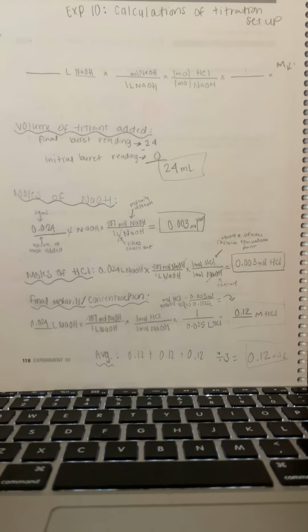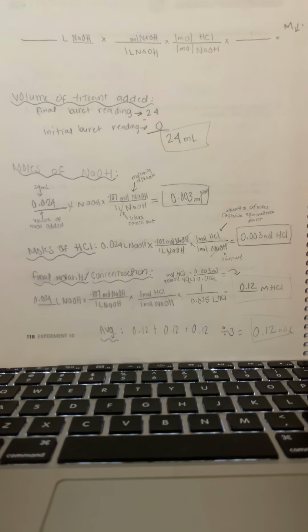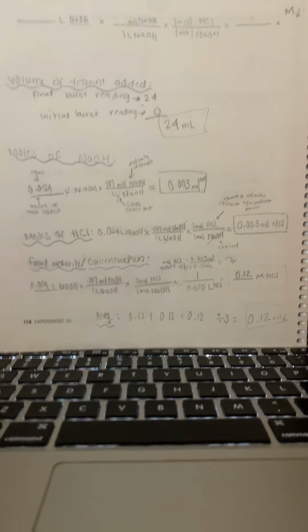Hello class, my name is Sarah and I'm going to be performing experiment 10 today with the calculation setup of the titration that we did from last lab, which was setting up a titration. This is the calculations portion.